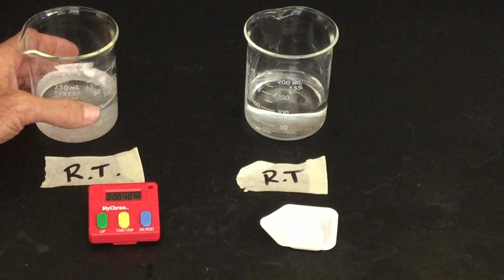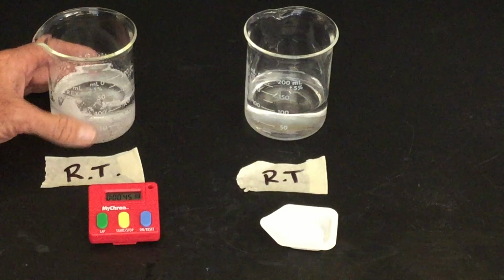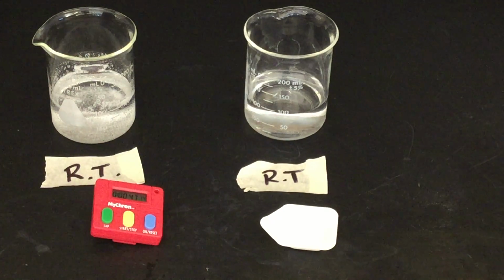Almost dissolved. There's still a couple pieces. They're beginning to break up. Okay, and that's about it. So it's 48 seconds.